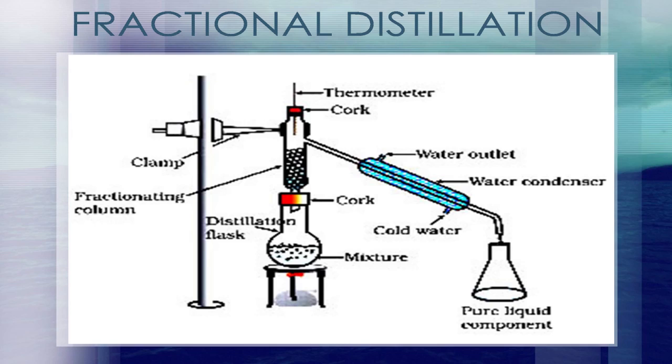A spinning band distillation system uses a spinning band of Teflon or metal to force the rising vapors into close contact with the descending condensate, increasing the number of theoretical plates.